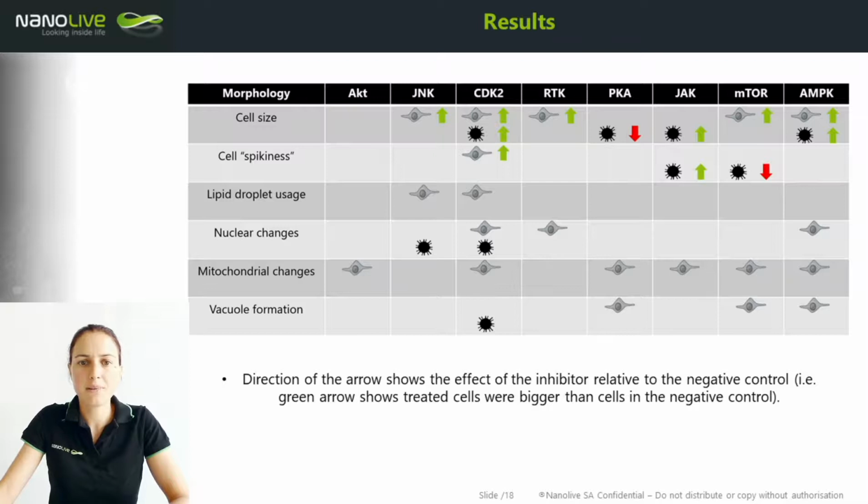So the first thing I want to point out is that glioblastoma cells are clearly much more resistant to kinase inhibition than pre-adipocyte cells, which we expected. Glioblastoma is one of the most aggressive forms of cancer. This is why we chose to focus today on the response of pre-adipocyte cells to show you clear treatment effects.